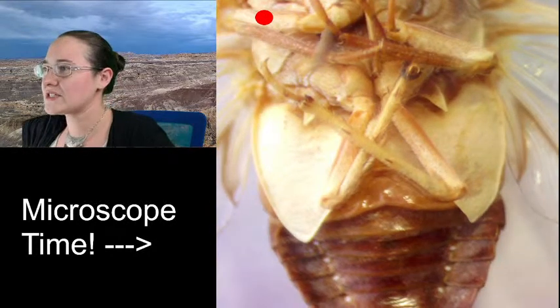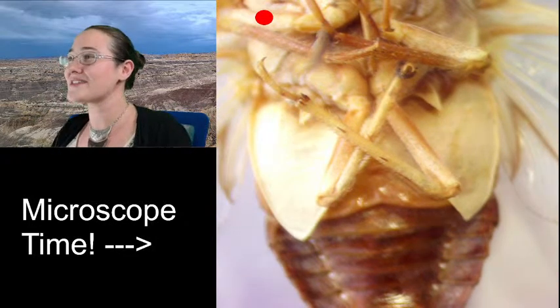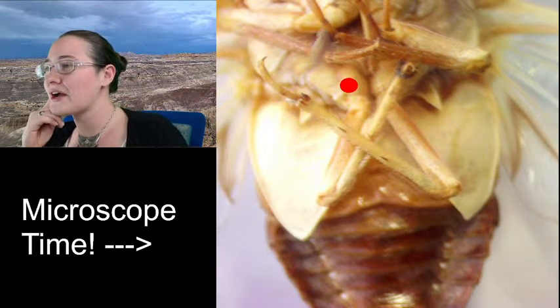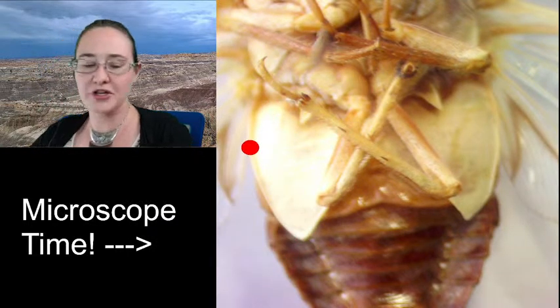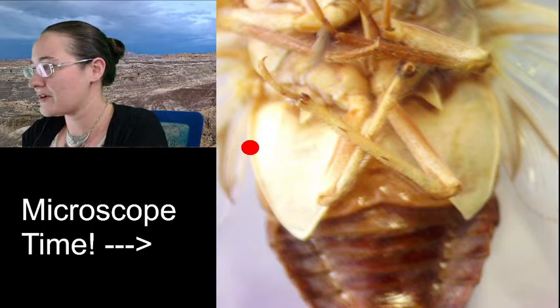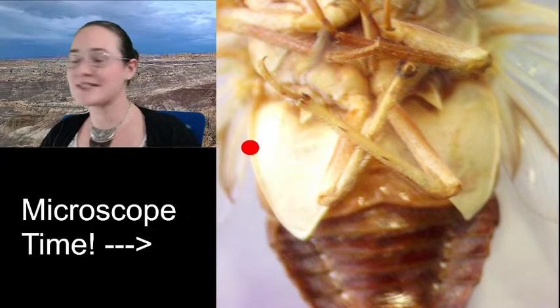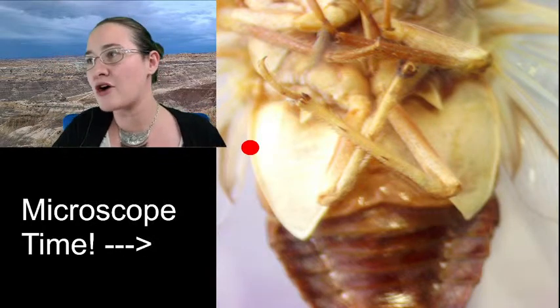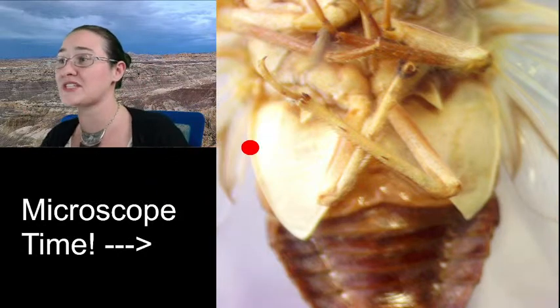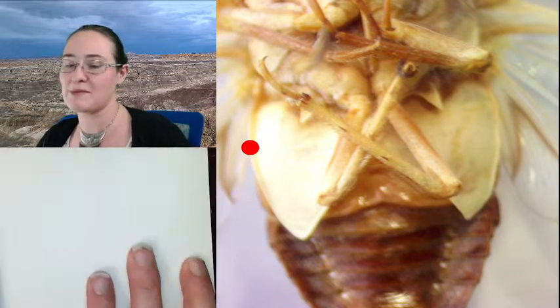All right, so you cannot see the timbals from this angle, because what you can see are these large triangles right here. These large triangles are called operculum. I'll go ahead and type that in the section so that you guys know how to spell it. They essentially make a sound chamber that helps when the timbals underneath them are making the sound.